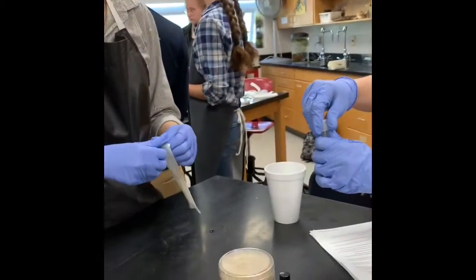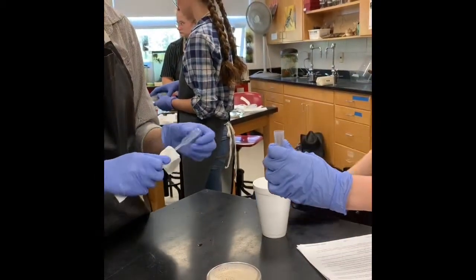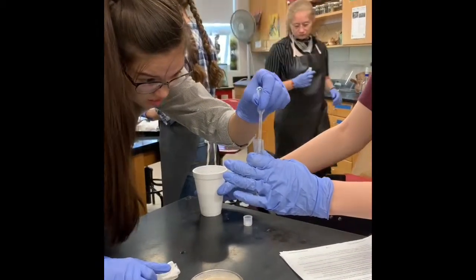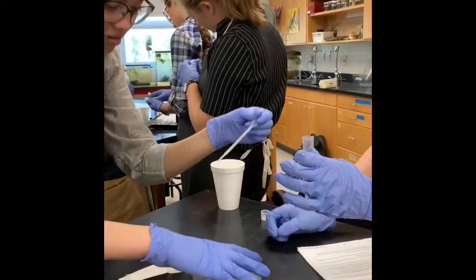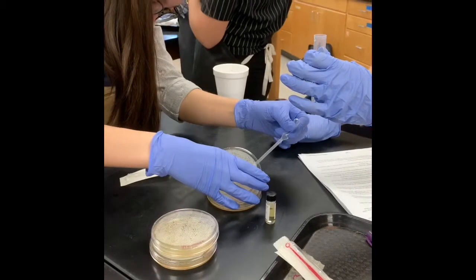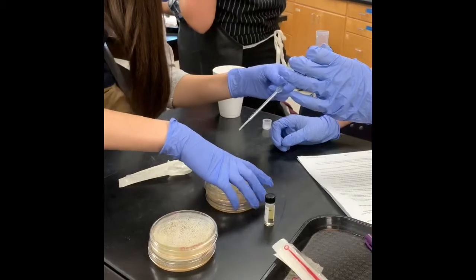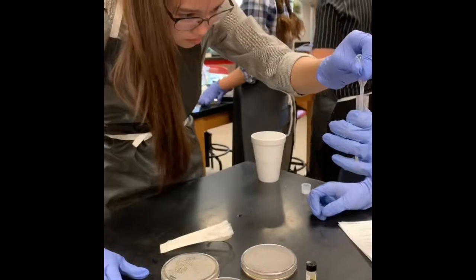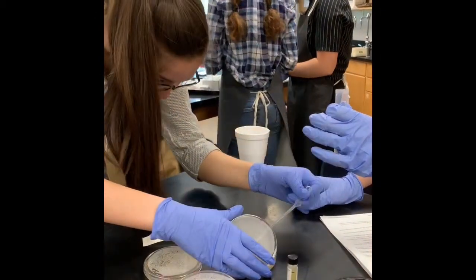Remove half the cells from the plus plasmid tube to each of the plus plasmid plates. To do this, use a clamshell technique to distribute the cells into each plate. Roll glass beads within the plates with a back and forth motion to evenly coat the agar. Let the plates rest several minutes after taking out the beads. Repeat for the minus plasmid tube.